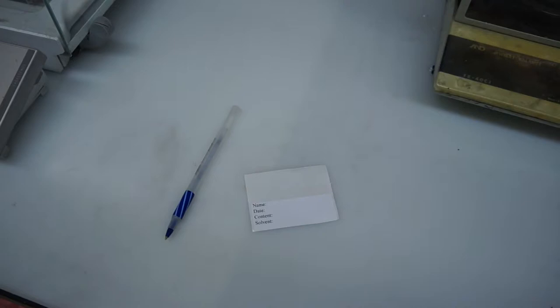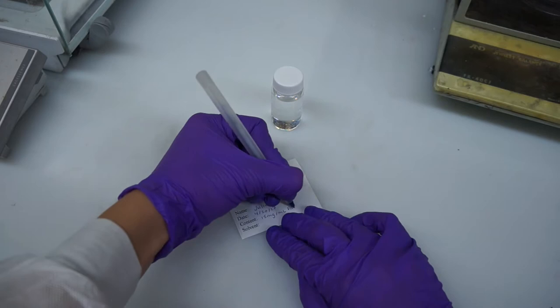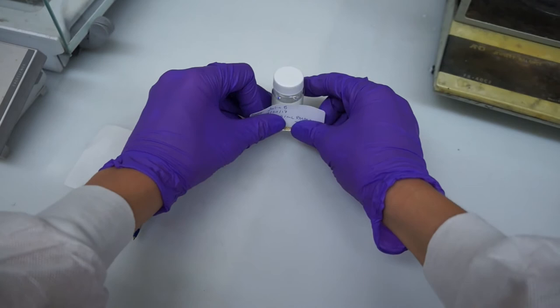Now we can label our PMMA solution. I've put my name, the date, and the concentration of the solution, including the identities of the solute and the solvent, in this case, PMMA and toluene.